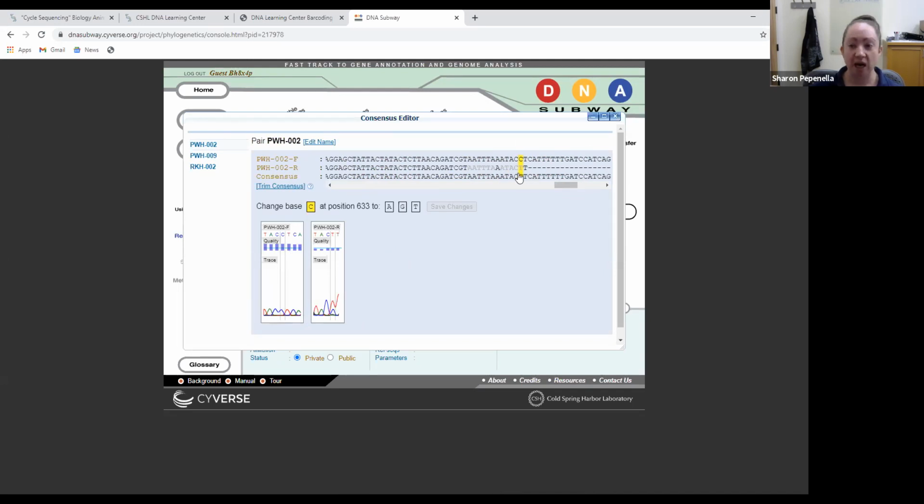So again, that's why we're seeing that here. And any other low quality sequence, it's where here we have an A on the forward and an A on the reverse, but you can see the A on the reverse is that light gray again. That's because we had that nice clean peak here. We also have that peak in the reverse, but it's again being overlapped with this kind of blue peak here.